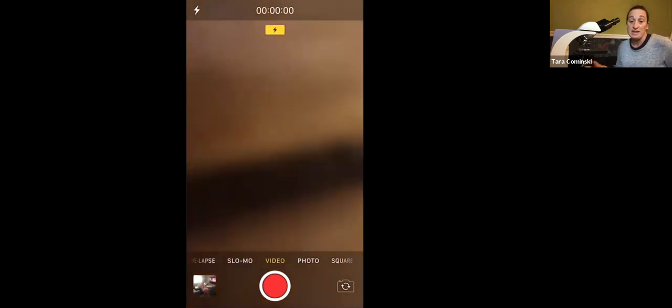Okay, so if you can, it looks like you see nothing, but at the top, you can see there's a black thick line. Well, that's all we see of the letter E now, okay? Because it's been magnified so much, in that field of view, because we're on such a higher magnification, we can only just see one little part of that E. We can't see that entire E anymore, okay?